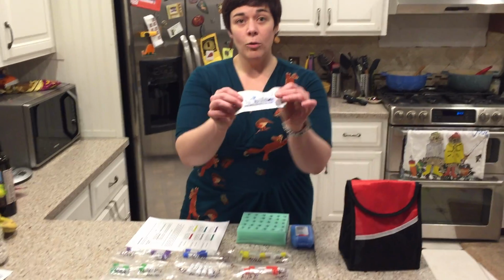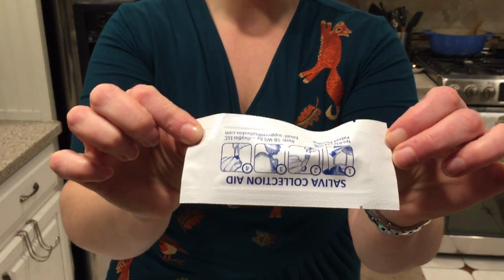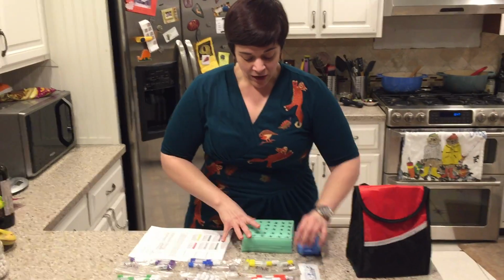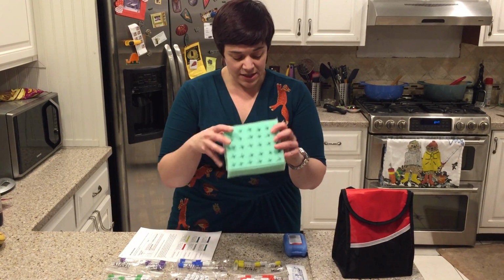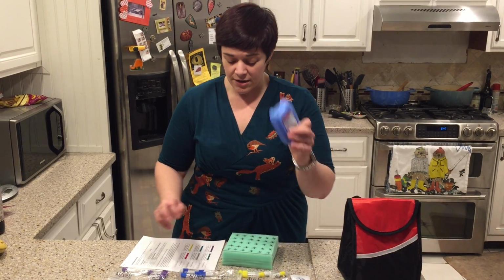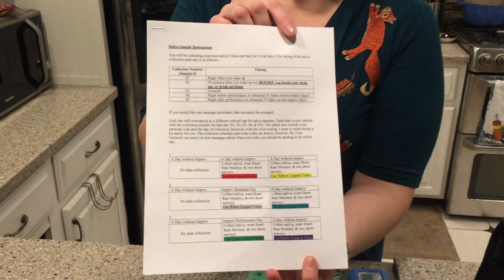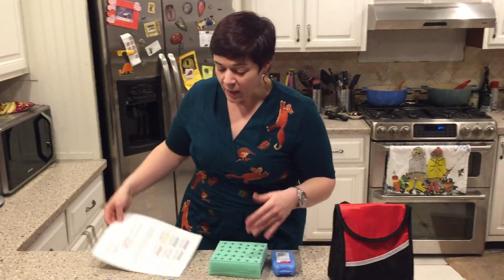You're also going to have a whole bunch of these, which are the straws used to help you collect the saliva. I only have one out here now, but you will have a whole bunch. You're going to have a foam block to help store those tubes once you've spit into them. You're going to have an ice pack that you should put in your freezer as soon as you get this lunchbox home that first night. And then you're going to have a set of instructions that are going to tell you basically everything that I'm telling you through this video that you can refer to at any time.